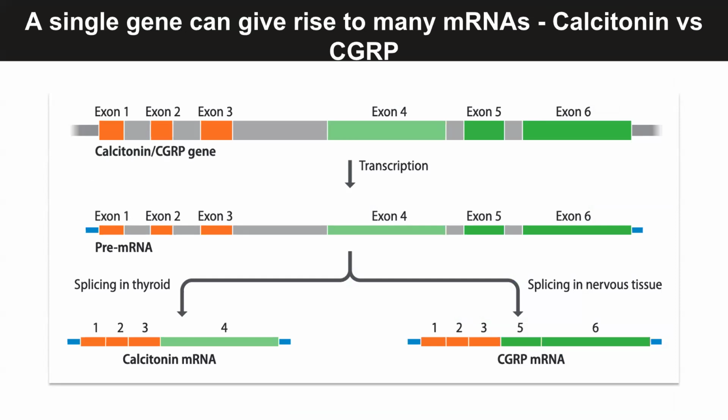These will be overrepresented. So one thing that we also want is to be able to tell if we have a technology which can capture this data. We want not only the resolution to tell us where exactly in the genome it came from, so which gene is expressed, but also how many copies of the isoforms that particular tissue has. Okay? So it's a multifactorial problem in that sense: A, where exactly in the genome is the sequence arising from, and B, which kind of sequences are represented in your data.